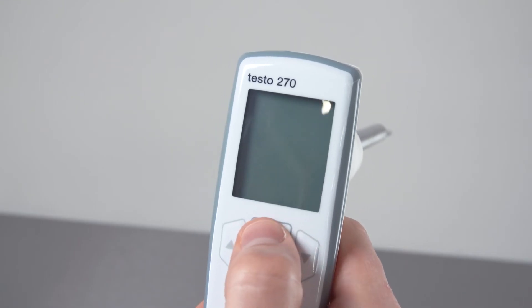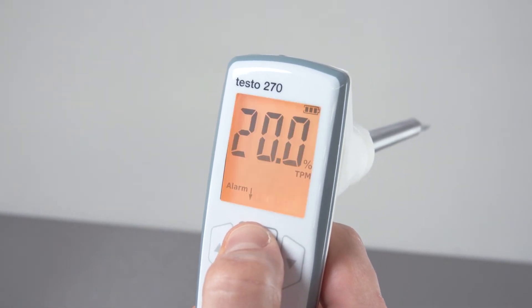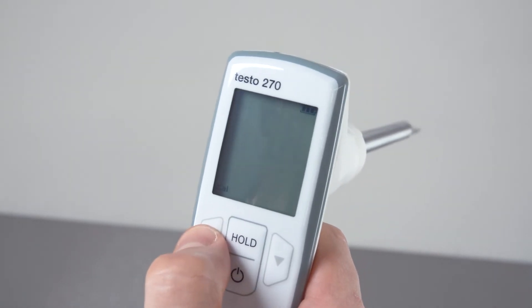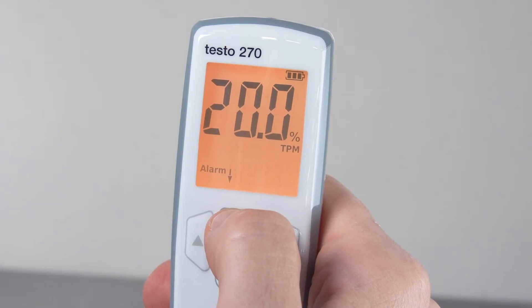Now you can navigate through the various menu items using the hold key. If you want to change a pre-setting, press the arrow key and then confirm with hold.